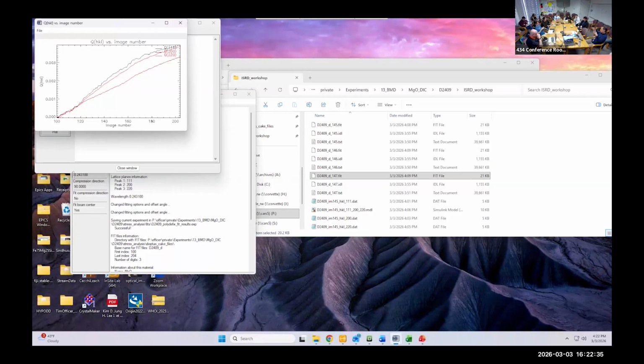Because as Pam explained, you assume an average matrix and you plug one grain into it. And this grain, you don't care about the shape, but you assume it's an ellipsoid. And then you modify the matrix response because of that grain. And then you plug another grain into it. And in reality, the diffraction gives you signals only from those grains that satisfy the Bragg condition. There may be tons of grains that we don't see here. So it's a very complicated issue, and I don't think there's a perfect solution at this point.